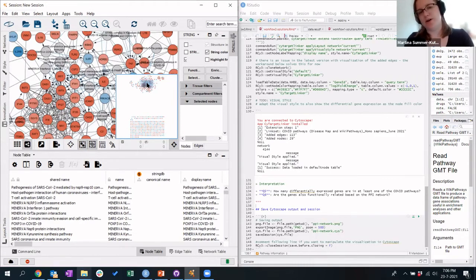Just as an example, the yFiles layout cannot be automated, as far as I know. That's a licensing issue, so that means that you can only do it manually. Now, in this network, the colors represent the log fold change. In this case, I used the same setting as before. You can obviously make this a lot bigger, right? So let me give an example.